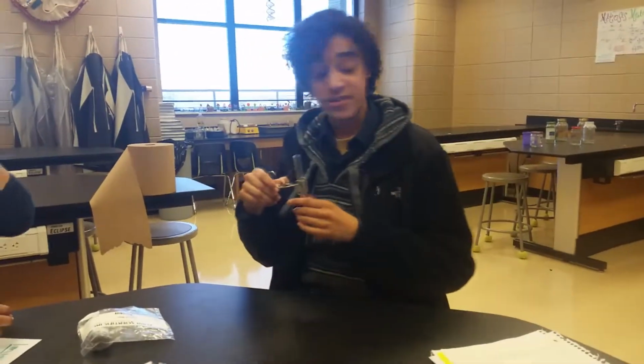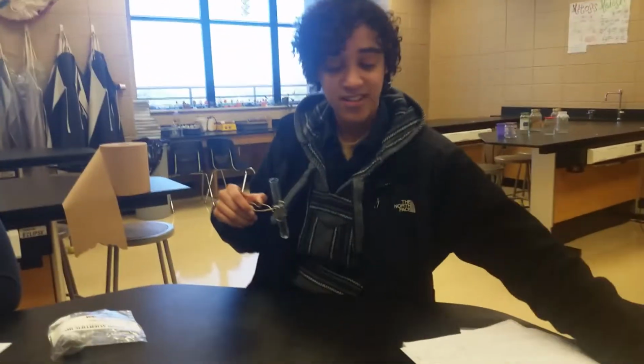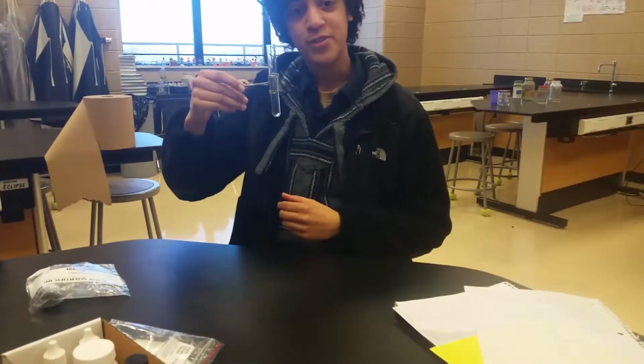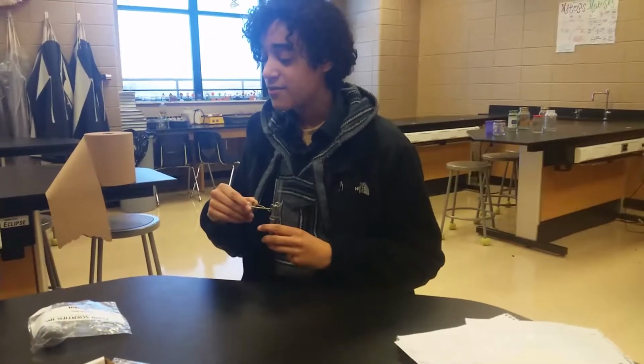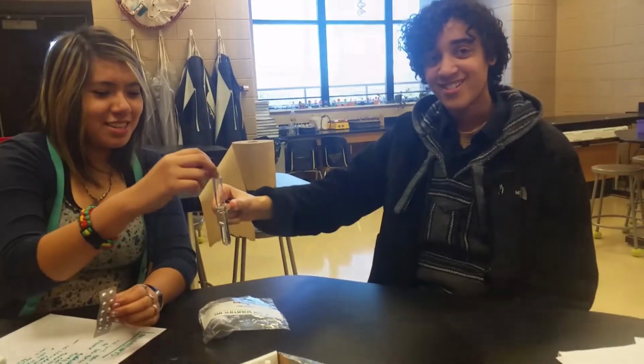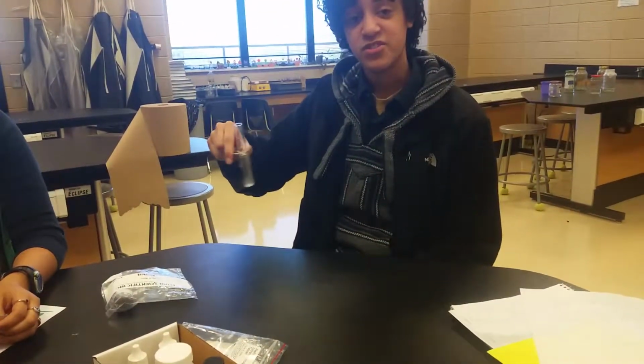So for our nitrate test, we took our sample solution from each location, and we have nitrate tablets that we then dissolved into the water. It takes roughly 5 minutes to dissolve.